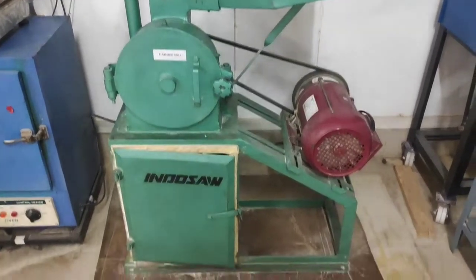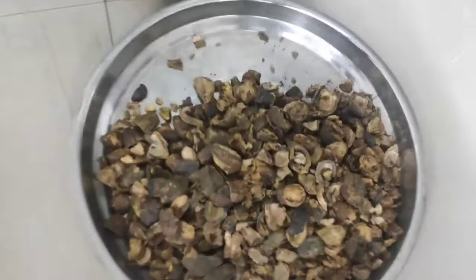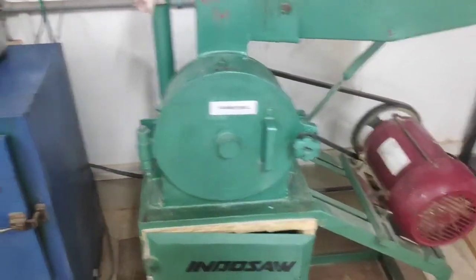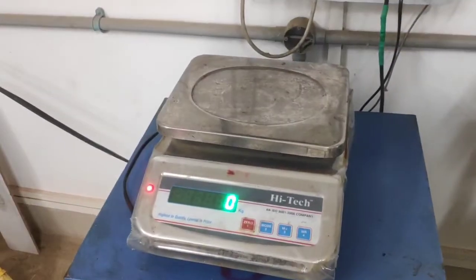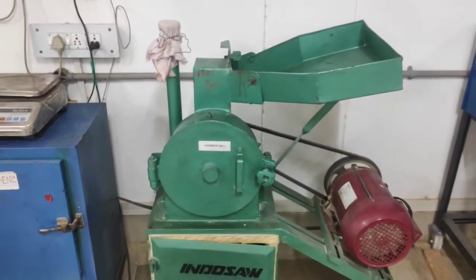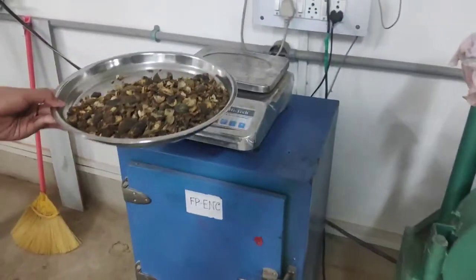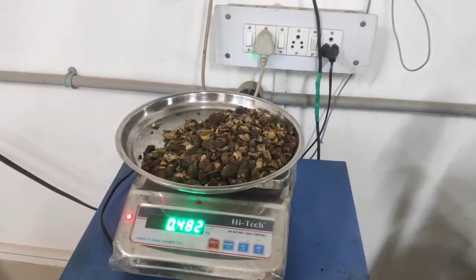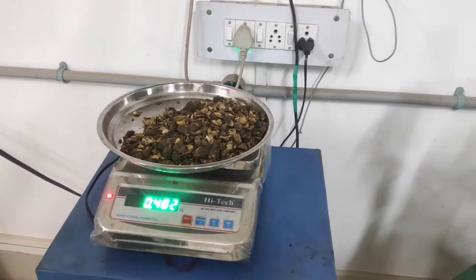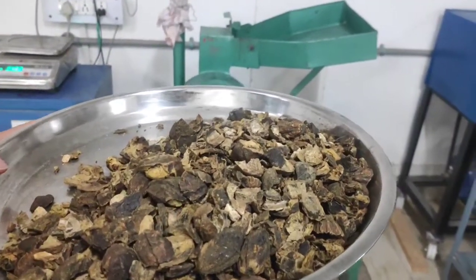The requisites of today's experiment are Terminalia cabula pericarp, empty plates to collect the product, the hammer mill, and an electronic weighing balance. Let us now weigh the sample before milling it. It is approximately 400 grams. Now let us feed the weighed sample to the hopper of the hammer mill.